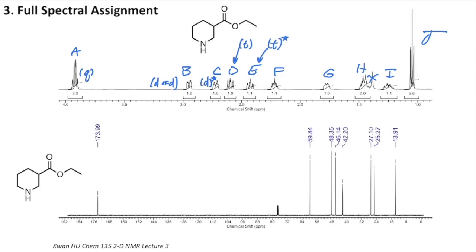And what about F? Looking at F, it's very hard to tell. I'm definitely seeing more than a few splitting peaks happening here, and it's not really a pattern that I can make out very well just on inspection with my eyes without zooming in any further. So I'm going to start by calling this one a multiplet. When we figure out which proton F is, we can maybe come up with what the splitting should be, but for now, leave it as a multiplet.